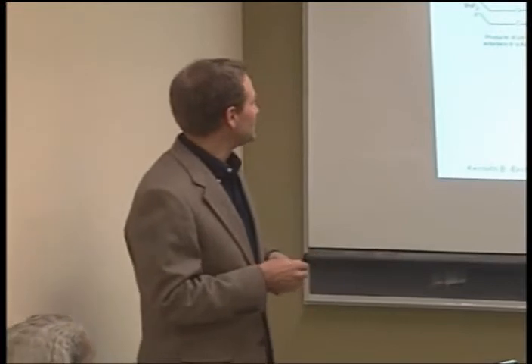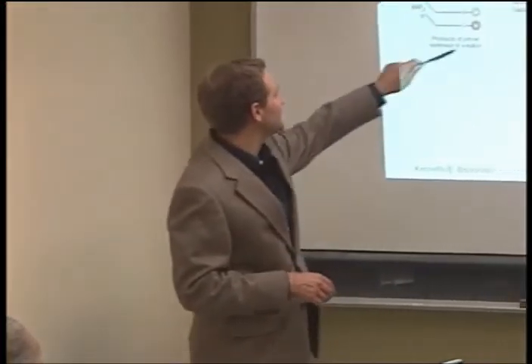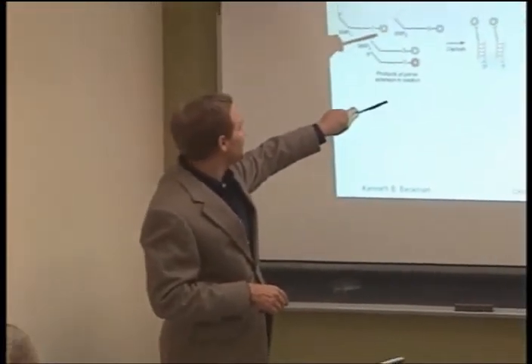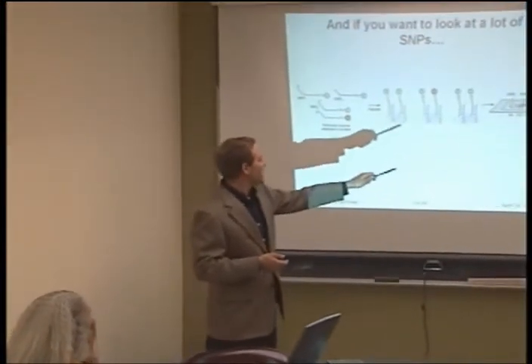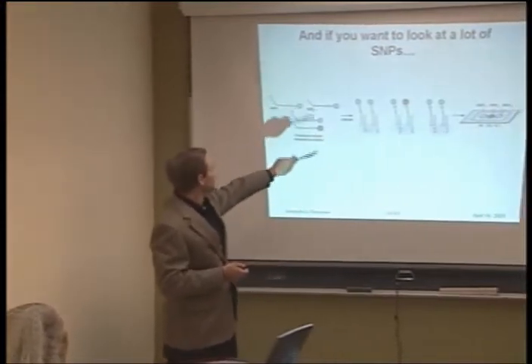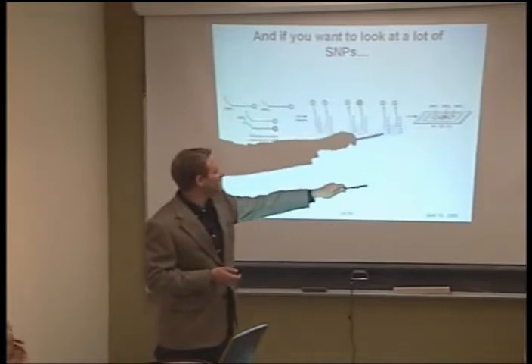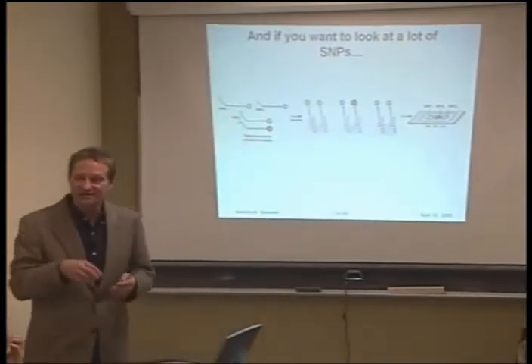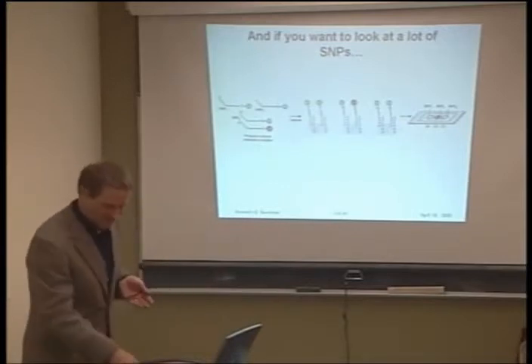For that, of course, you can take a technology, and I'm not going to go into the details here except to say, here's a detection technology. In this case, I think it's the mini sequencing approach that results in different colors. And you can, on a microscope slide, have different spots that have got different capture probes that will separate and localize these differently labeled molecules to different spots on the slide. And this is shown here. Different spots on the slide can be queried by a laser, for instance, and you can get information about thousands of samples at the same time.